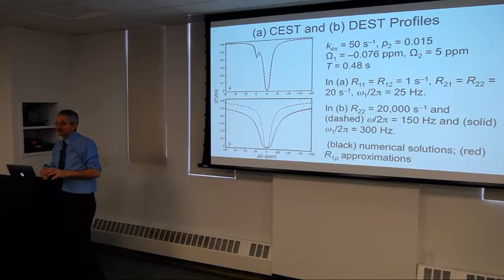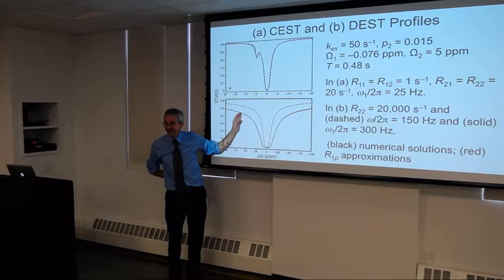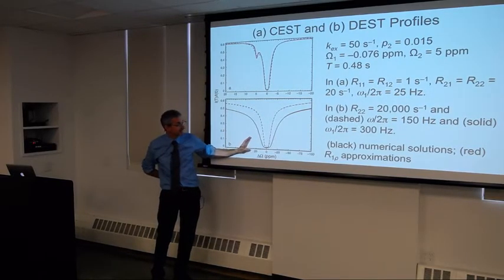But whenever the peptide is on the protein, or on the fibril, we'll then get saturation transfer. So it's the same effect. We are marching the frequency across the spectrum.